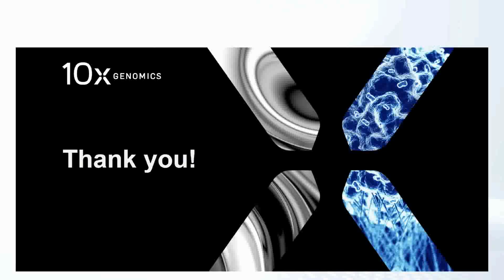Well, we're really mindful of this, and I think I've made this clear a couple of times that as we do look to increase the panel density, we don't want a linear increase in the time it's going to take to run that. So if it takes 4 times as long to run 20,000 as it does to run 5,000, we're at 6 days for 5,000. Do you have any appetite for running your instrument for 20 days? Probably not. Or the amortization of that instrument, it doesn't make business sense for you to do that. So no, we're very mindful of the fact that it's probably not a mass market product if it's going to take forever to run a single sample.